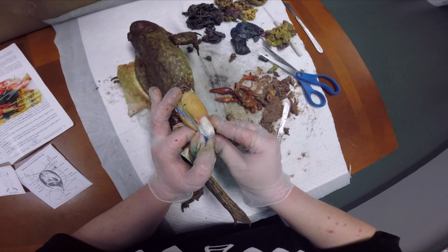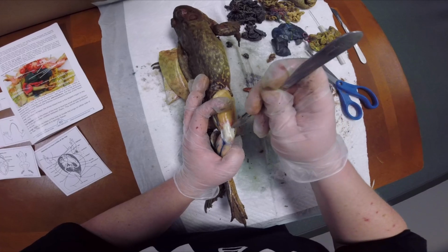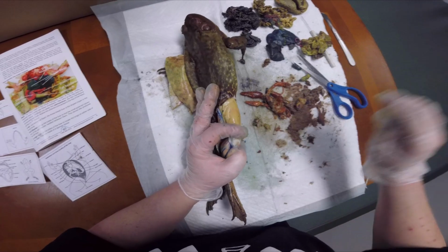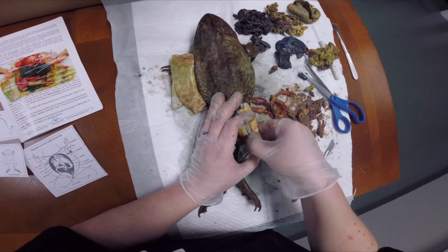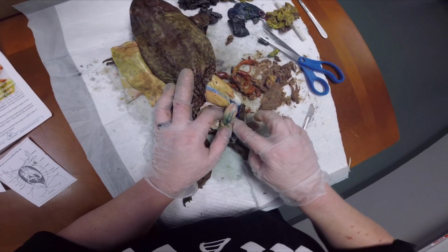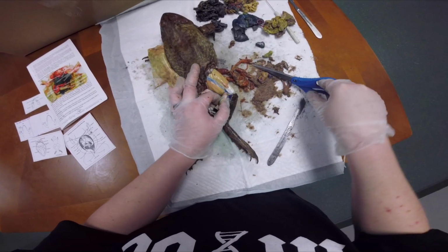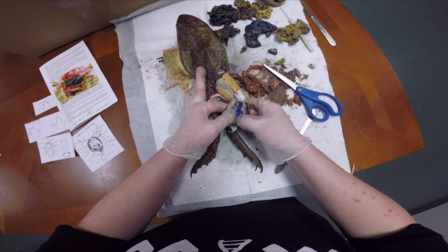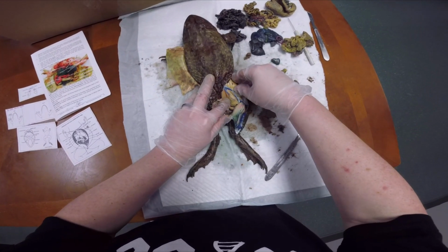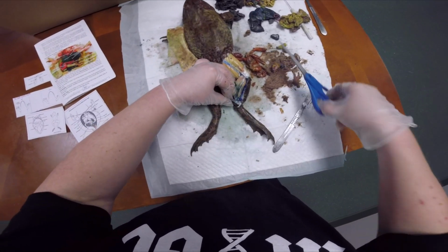And if you have time, you can also look at the kneecap. This one might break our scalpel. But you can move that kneecap and look at that. So here's the, man, this one is a tough one. There's the inside of that muscle. Okay, and then there's the top part, and you can see why people like to eat those.